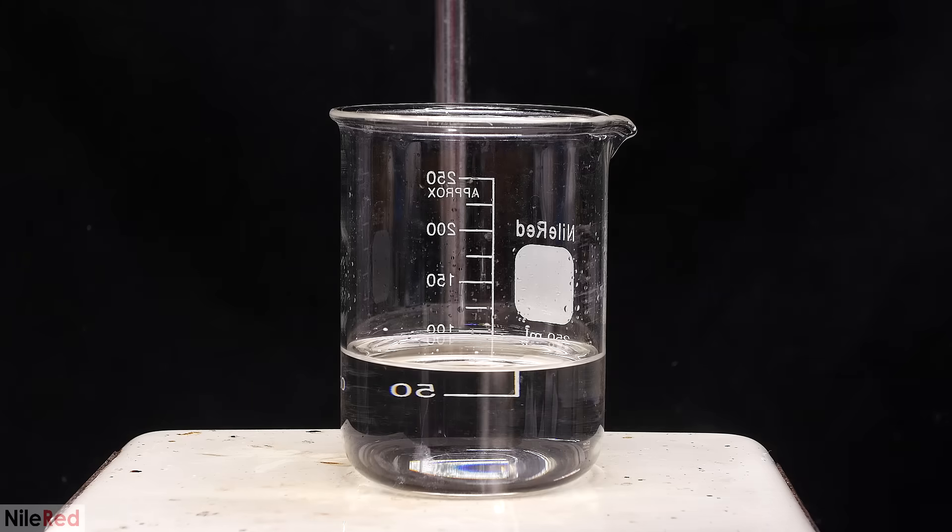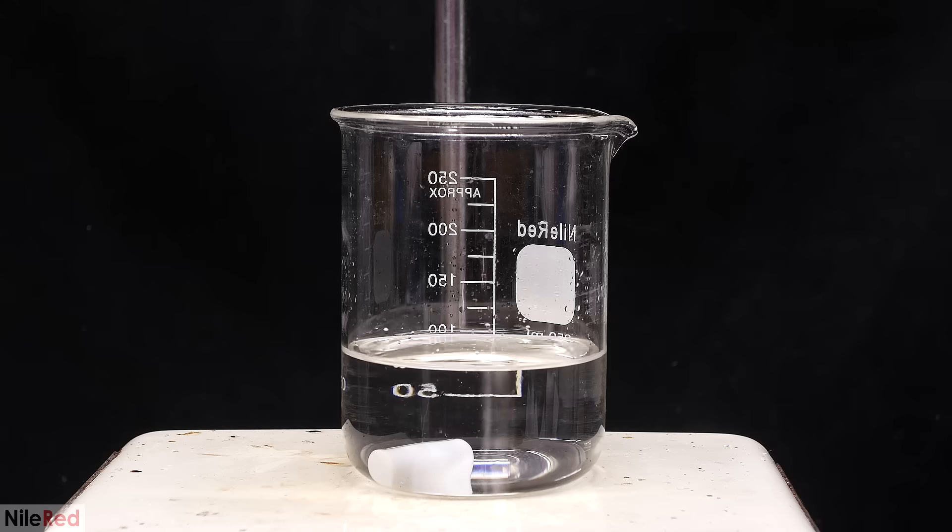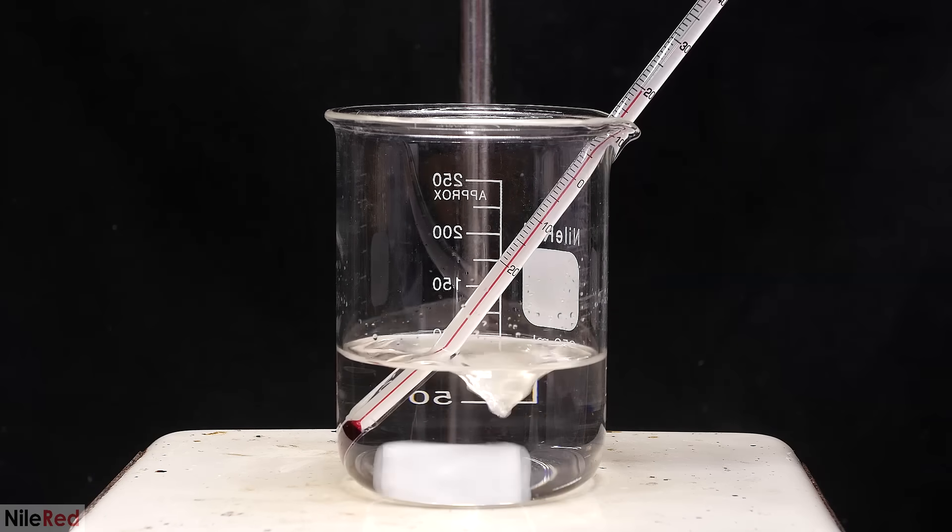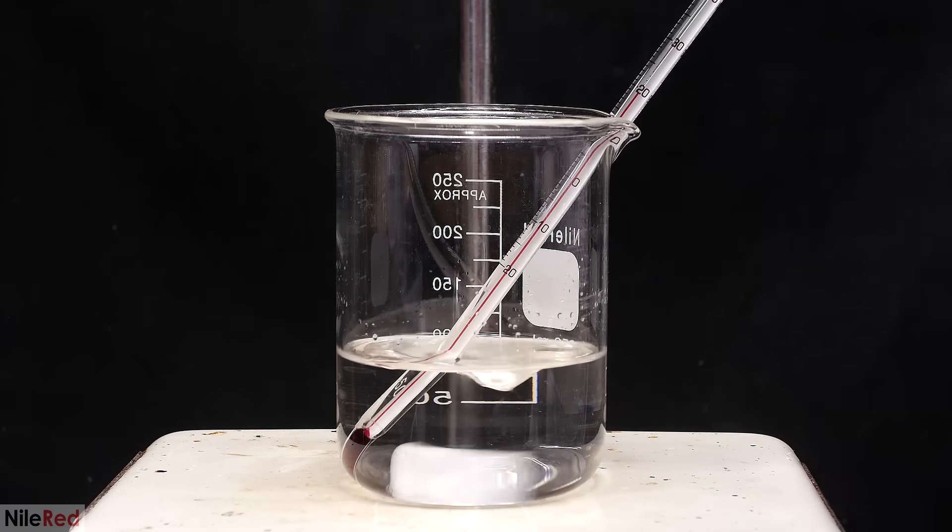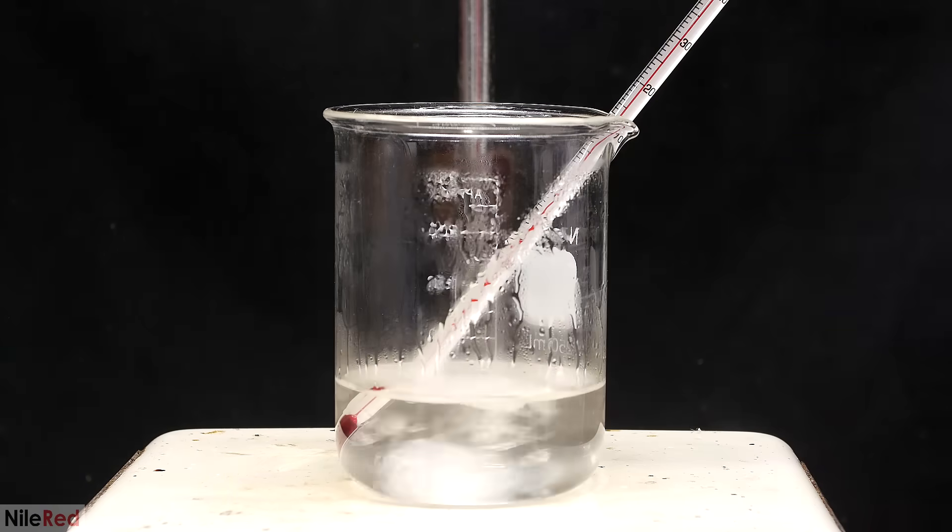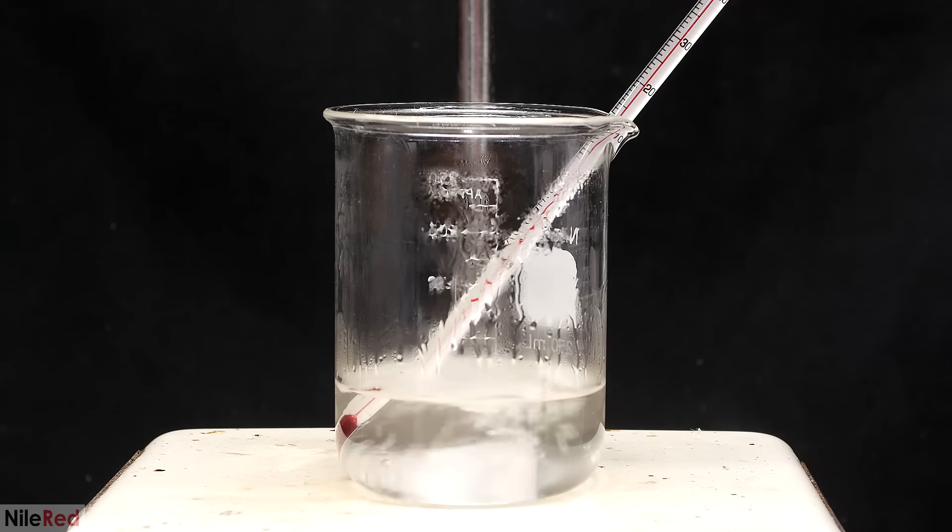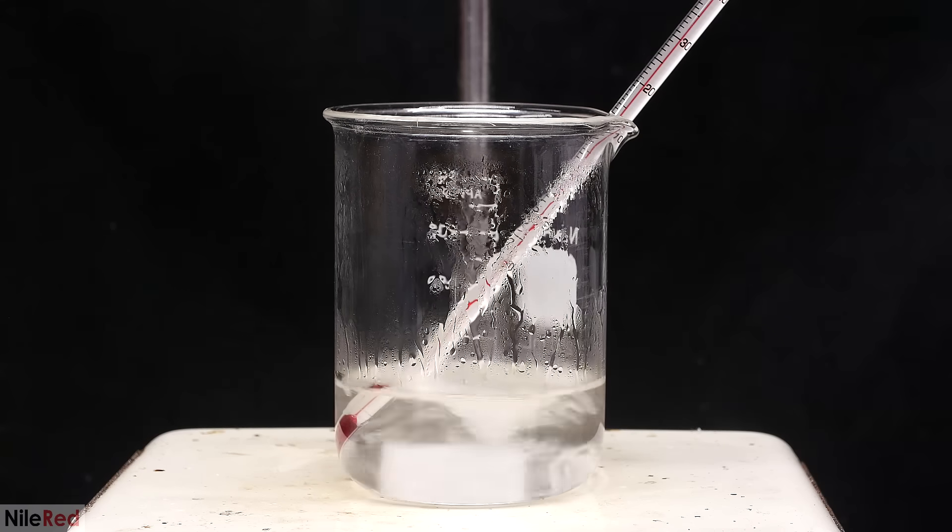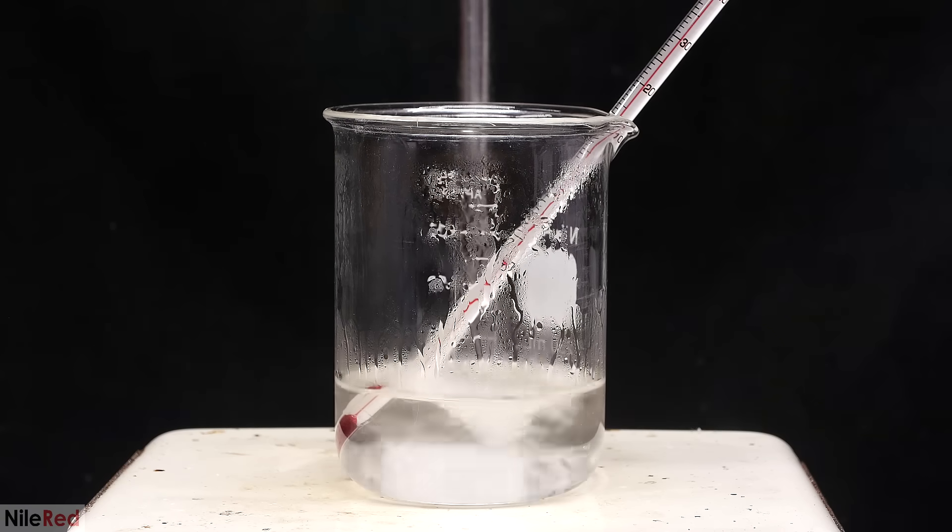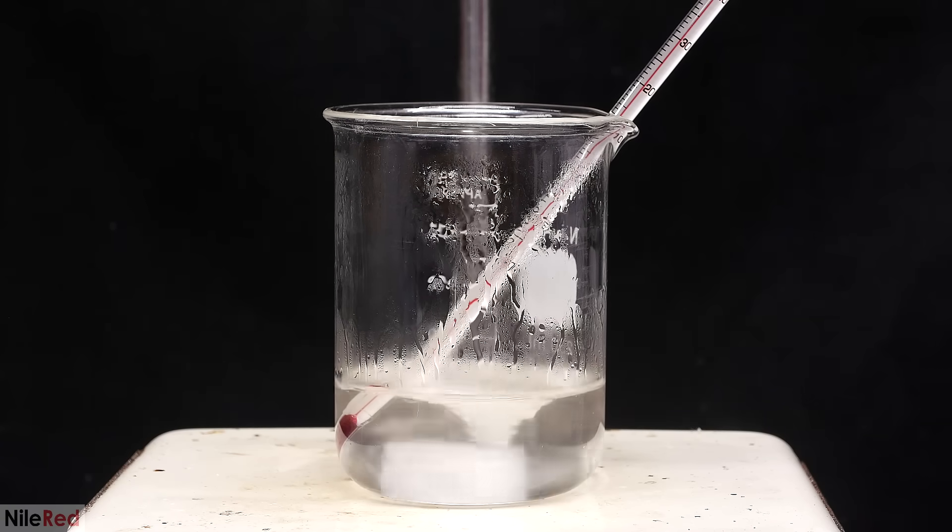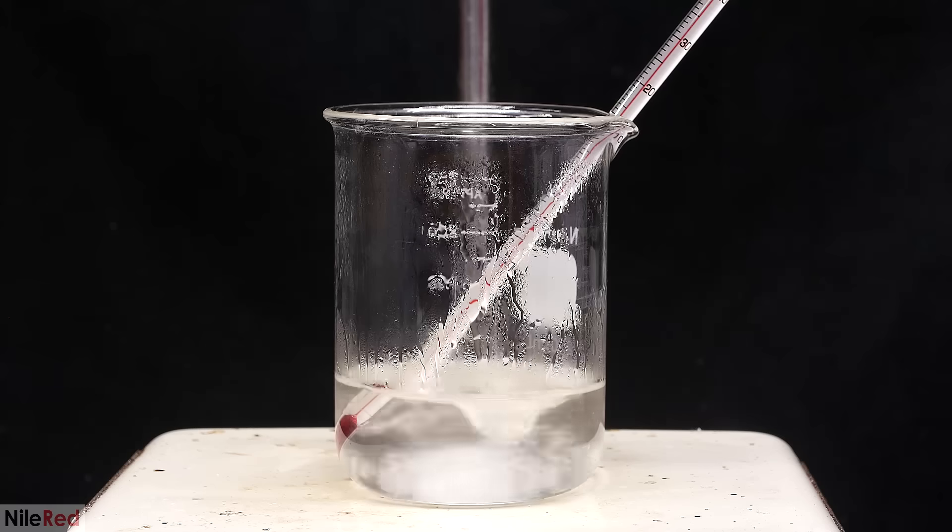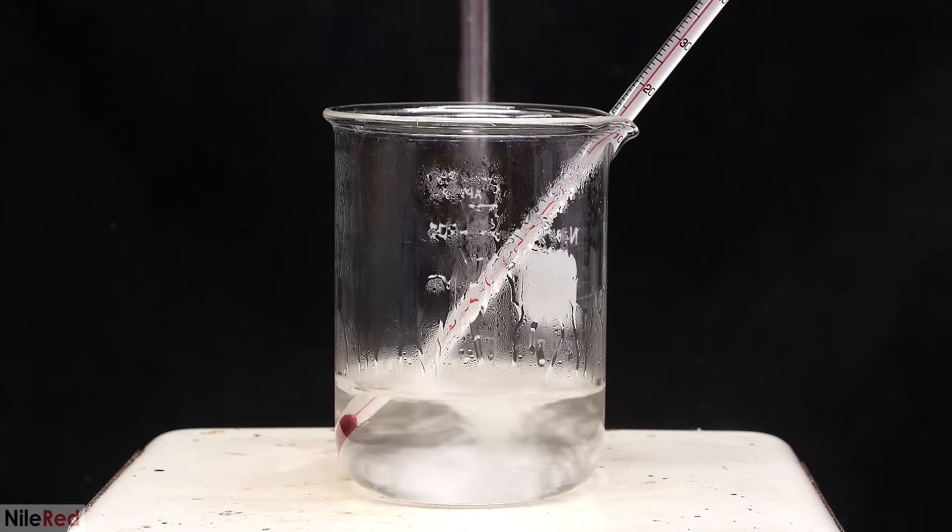Now we need to isolate the chlorobutanol, and to do this, I'm going to boil off all of the acetone and any unreacted chloroform. To make sure that all of the solvent is gone, I'm going to heat it right up to the melting point of chlorobutanol, which is around 95°C. This is well above the boiling points of acetone and chloroform, which both boil around 60°C.